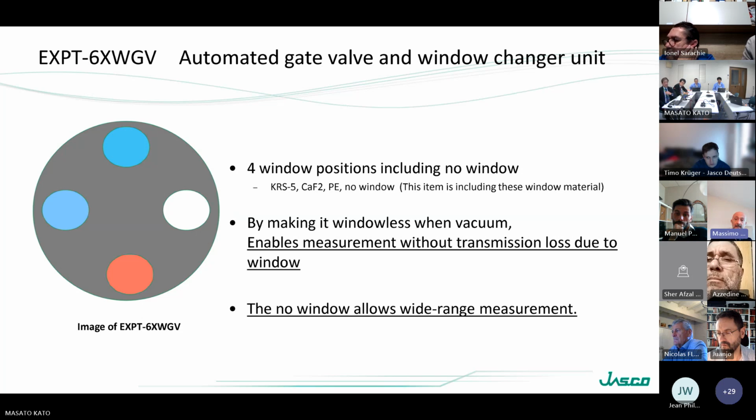Also comparing with the main competitor that we could have, which is Bruker. Bruker is offering a PM accessory attachment, called PM 50 or something like that. That seems standard for them. So this is the perception of the customer, that they are purchasing something standard. For us, it's always something special, and it's not always good to propose something special instead of a standard one.